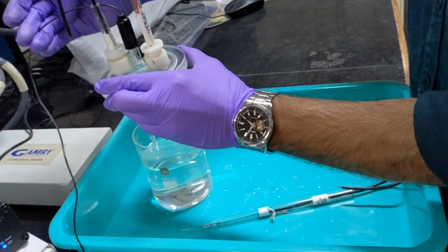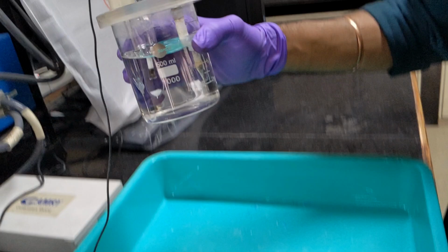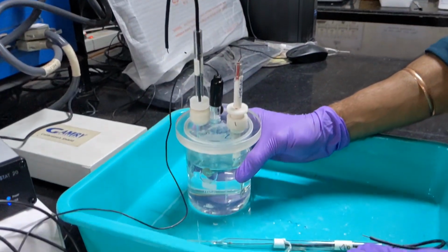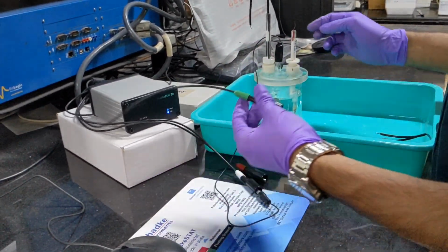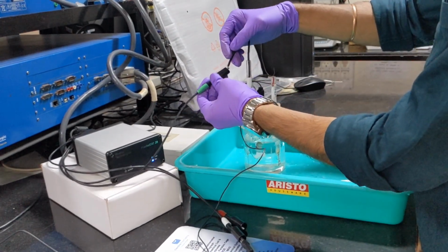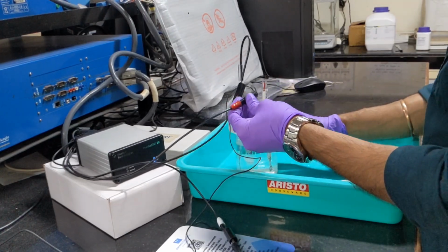Place all the electrodes inside the electrolyte and make sure that all the tips of those electrodes are immersed into the electrolyte. After this, connect the reference electrode with the white cable, working electrode with the green one, and the red one is for the counter electrode.